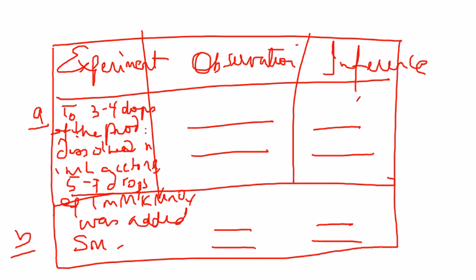Let's say you ran your reaction in the chemical test. You clearly see that the product is indicative of the double bond. In the IR, though, you see the double bond, but in addition to that, you see an OH as well. That OH could be water, because maybe your desiccant didn't work very well, or you didn't add enough desiccant, or maybe you didn't give it enough time. So those are a couple of sources of error that you should think of, and discuss that. On the other hand, everything might just tally perfectly well and come together for you. That's a possibility. So whatever it is, discuss that in your conclusion section.